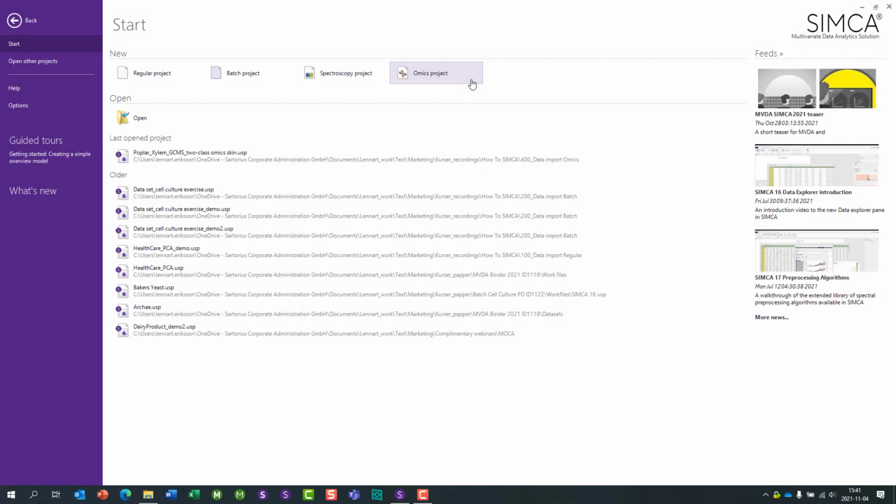Hi and welcome to this tutorial video on how to set up an Omics project in the SIMCA software. The dataset that we will use is part of our tutorial example called Poplar. This dataset is based on a study looking into genetically modified poplar plants by using GC-MS metabolomics.